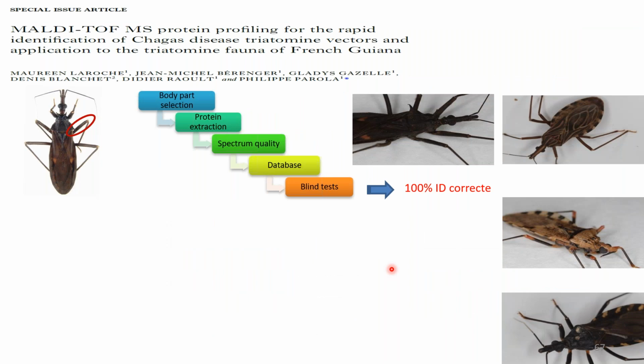So this is something I did a while ago on triatomines, which you remember I shared earlier. First thing was we had to find a core body part. And if you remember, we've been working on the legs so far, although it didn't really work for fleas and sandflies. But here, one leg of a triatomine is already much bigger than a whole mosquito. So we had to adjust. And it turns out the femur of the median leg was ideal.